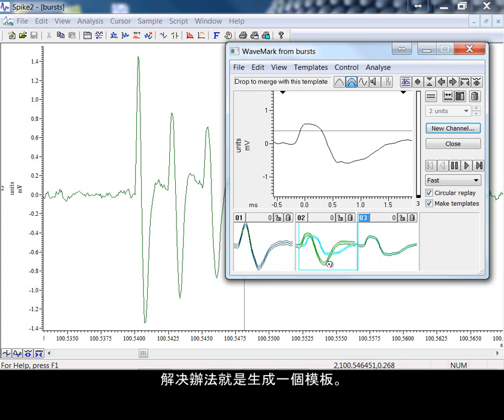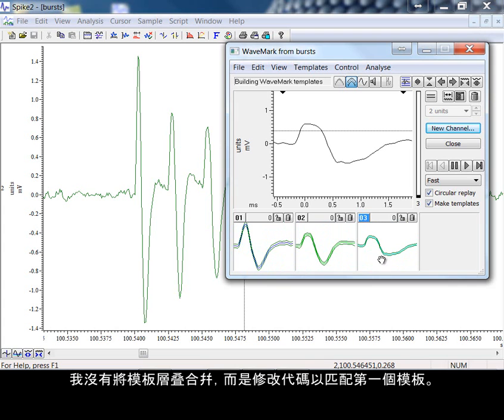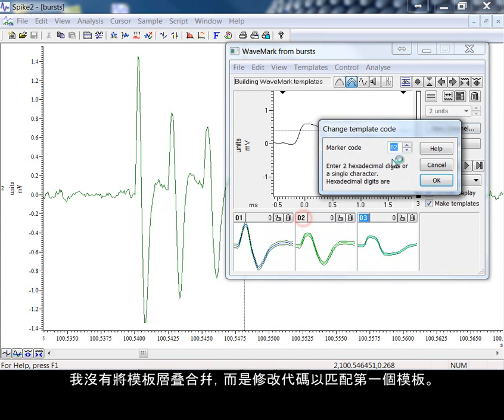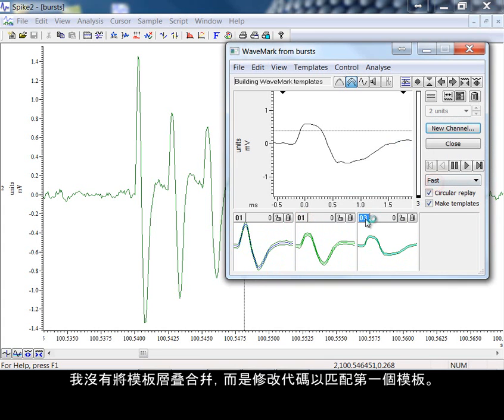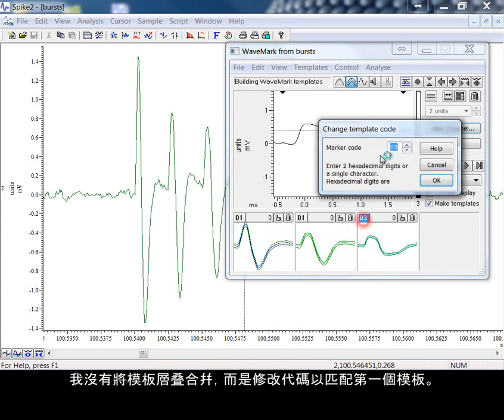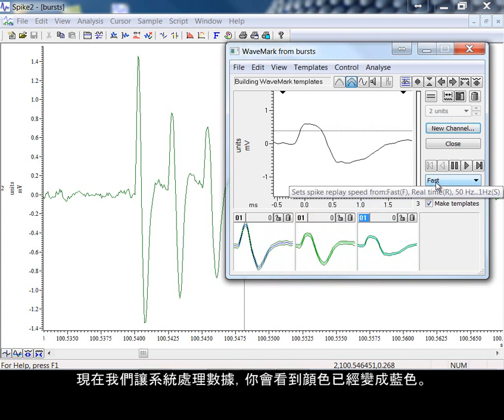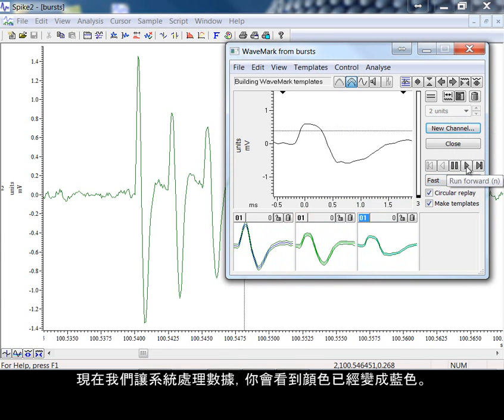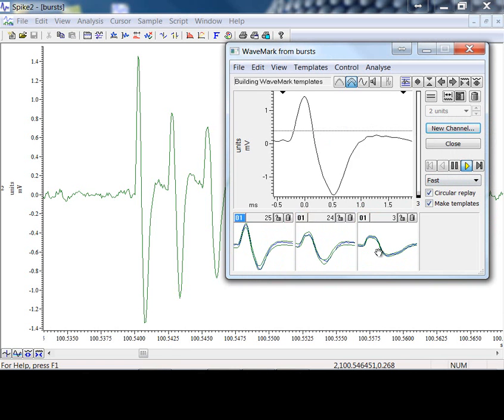The trick now then is to form one template. Instead of merging the templates by placing one on the other, I'm changing the code to match the first template. As we allow the system to run through the data now, you can see the colors have changed to blue.